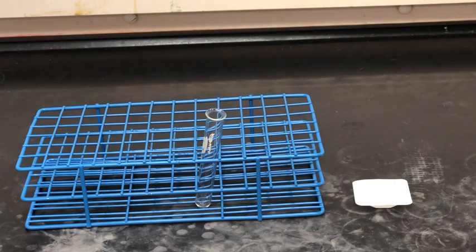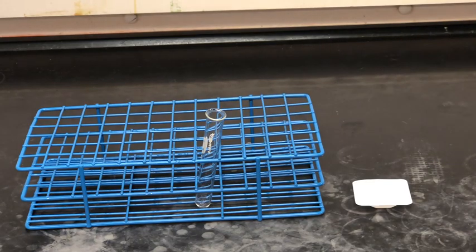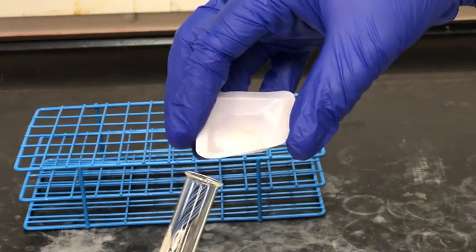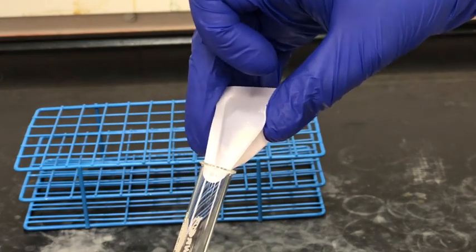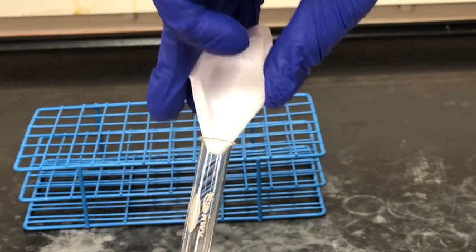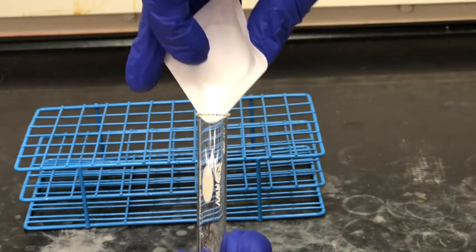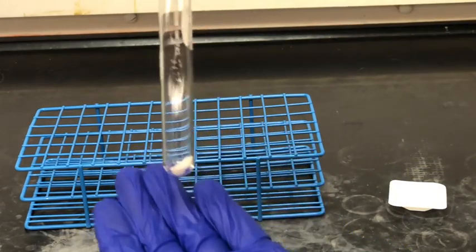Next we're going to transfer our impure aspirin sample into a 10 centimeter test tube. Weigh boats are pretty flexible so we can actually bend it slightly and pour the solid into the test tube. Some of it might stick to the weigh boat due to static or how sticky the solid is, so we do sometimes lose a little bit of sample in this step.